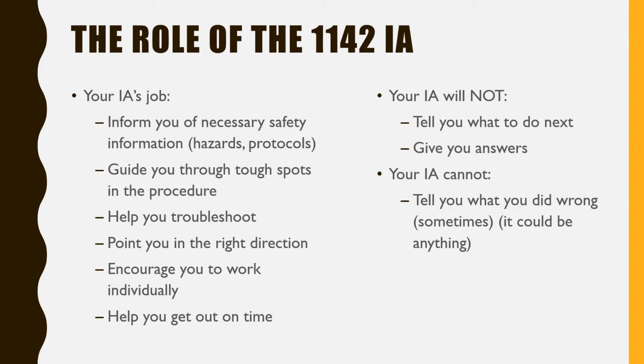If you go to your IA and you say, my titration didn't work, they're going to say, okay, did you follow the procedure? What did you do wrong? Did you leave out a step? And they may not know exactly what you did wrong because it really could have been anything. We've seen everything, like students putting the wrong solutions into burettes, forgetting the indicator, or putting water in the burettes, like all sorts of things. There's so many things that could have gone wrong. Your IA will help you troubleshoot to the best of their ability.